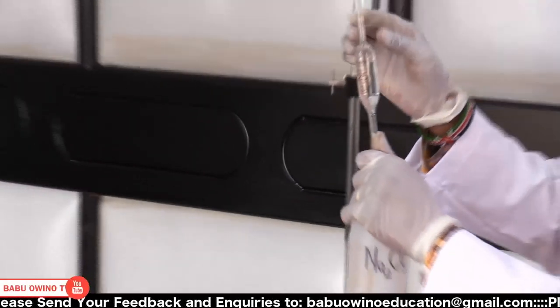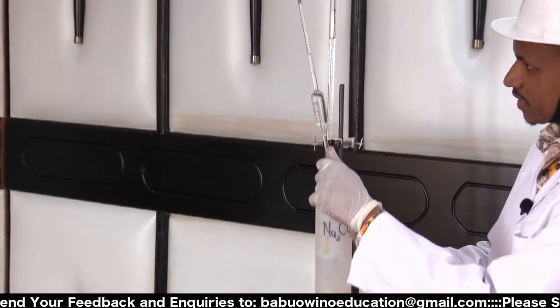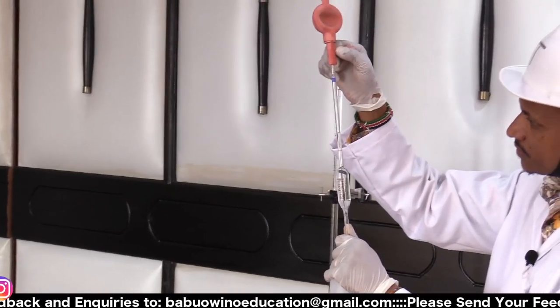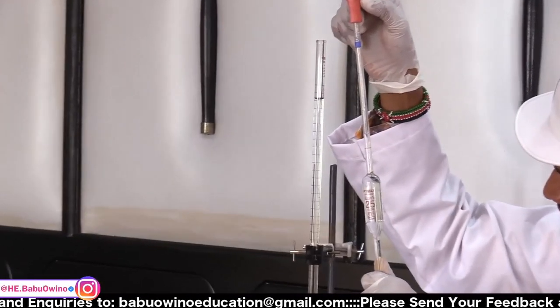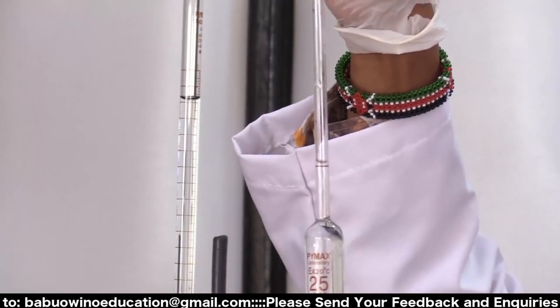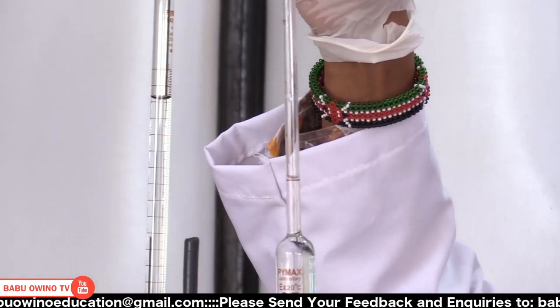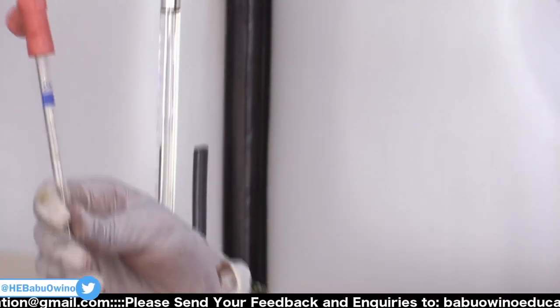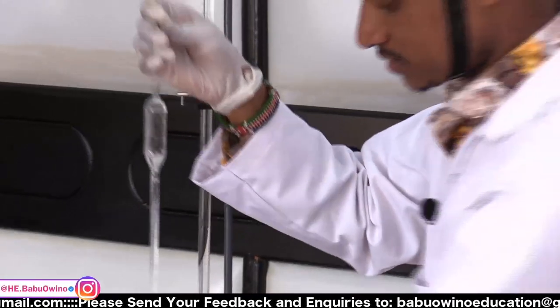And then you make sure you read it perpendicularly. So ensure that you are careful when handling this. So you release using this side of the pipette. Slowly. Then you read the bottom of the meniscus. There you go. So that's our 25 milliliters.